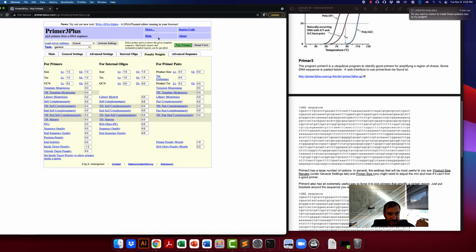And typically, the research group that thinks a lot about PCR, that spends their life dedicated towards researching it and reading all the papers on it, is going to have a lot more knowledge about this stuff than you, and that's why you want to use one of these programs. You could spend your time designing your own primer choosing program, or you can spend your time learning how to use software that was developed by someone else.